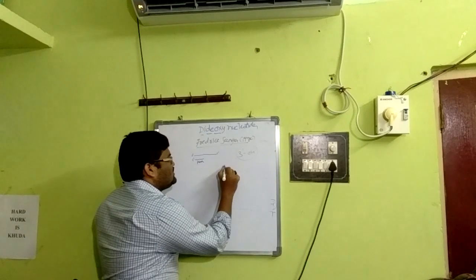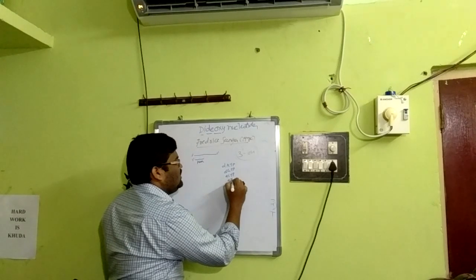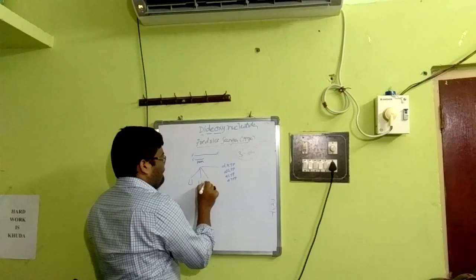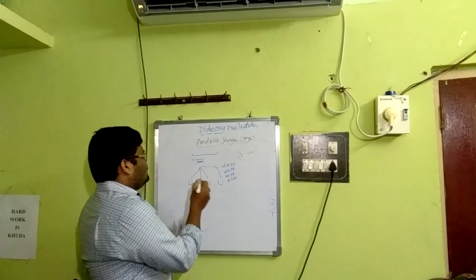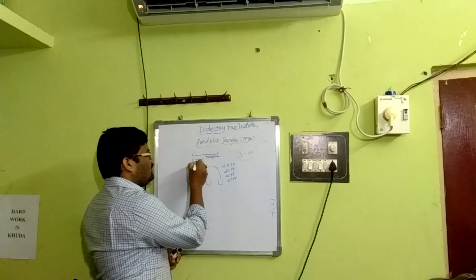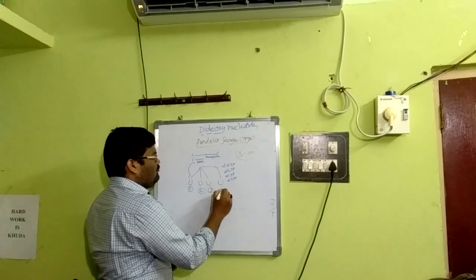After this, the raw materials, dATPs, dGTPs, dCTPs, and dTTPs, are distributed in four vessels. So distribute the template DNA along with the primer into vessels 1, 2, 3, and 4.